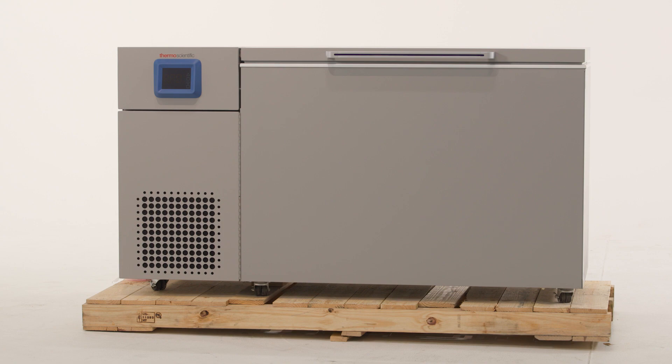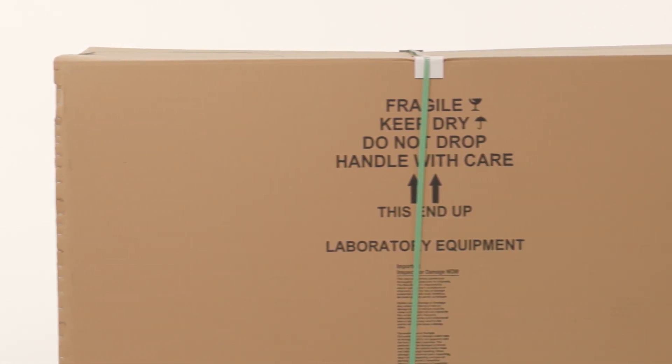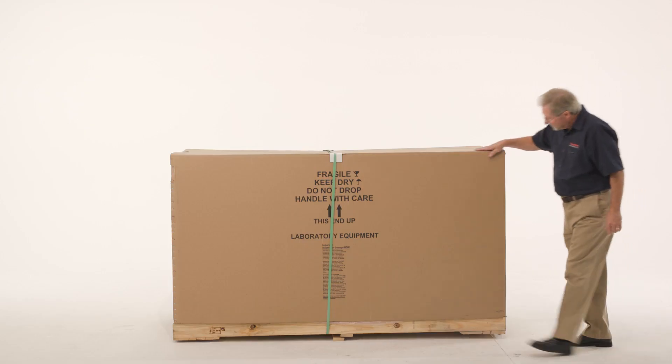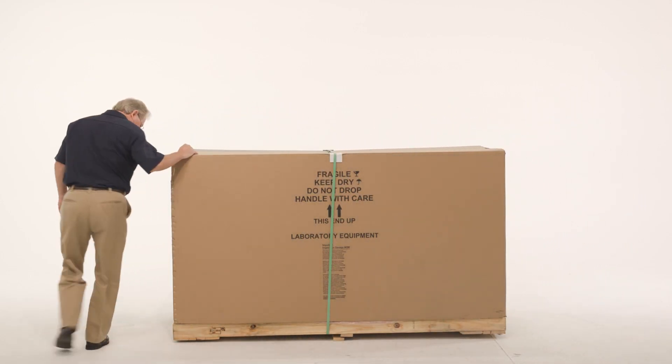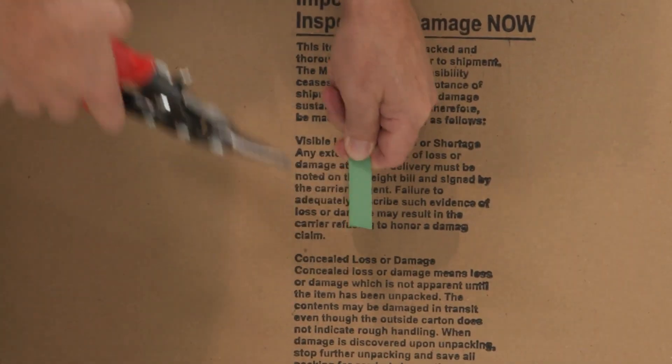Prior to unpacking, ensure you have enough space to properly install the unit. You will need a minimum of 8 inches (20 centimeters) of space on the sides and 6 inches (15 centimeters) in back, with enough clearance so that the door or lid can swing open at least 85 degrees.